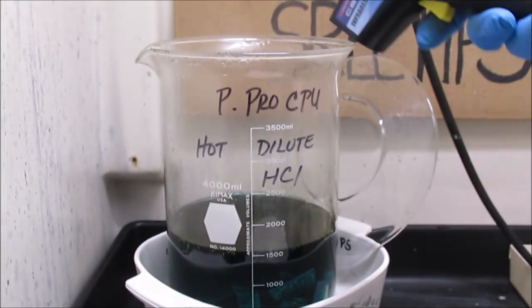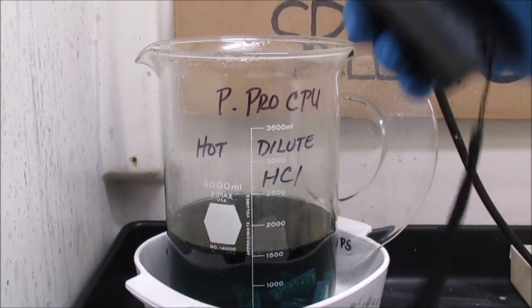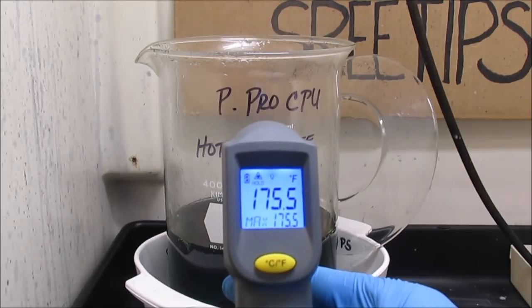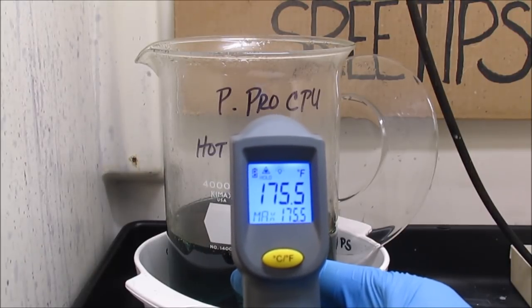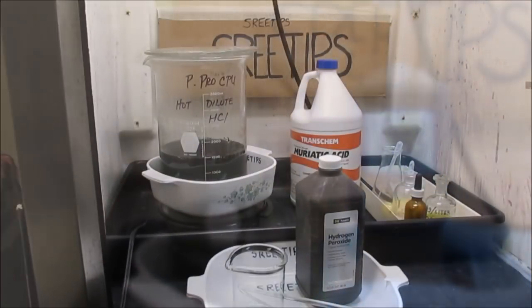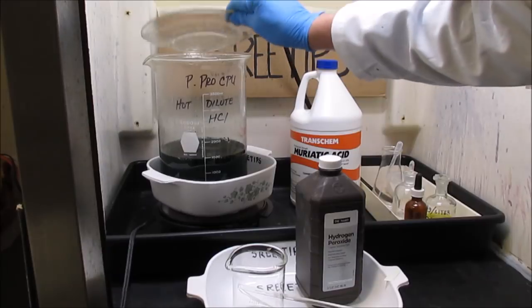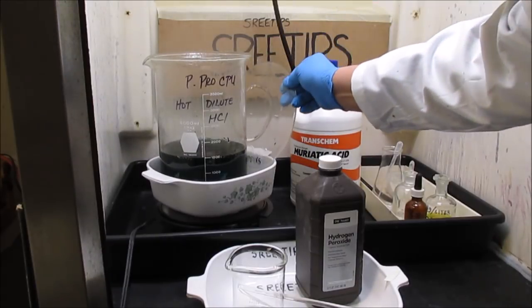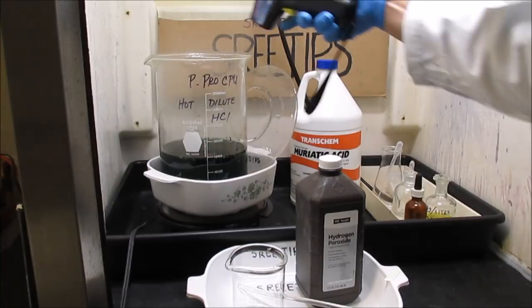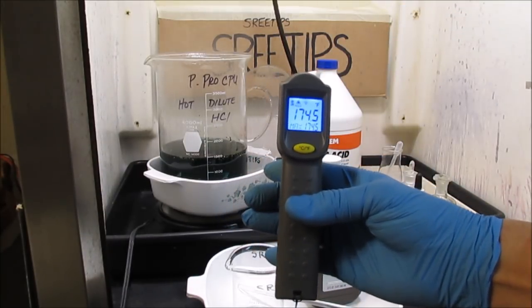I just added some hydrochloric acid to the beaker here, but I'm going to go ahead and get a quick reading and show you that the temperature of the solution is about 175.5 degrees Fahrenheit. The solution has been on the heat now for about 21 hours, and I'm going to get a temperature reading here. Got 175 degrees or so.